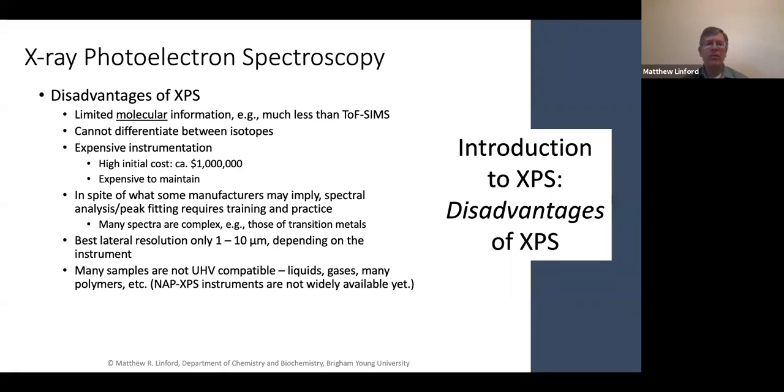There are a lot of samples that are not UHV compatible, many liquids, gases, polymers, etc. Just simply, you can't put them into an ultra-high vacuum. You can't put water. You can't put a biological solution into an XPS. Again, we'll talk about NAP-XPS in a few minutes and how that's really expanding the range of possibilities for the technique.